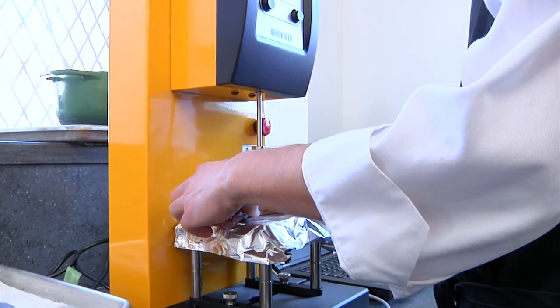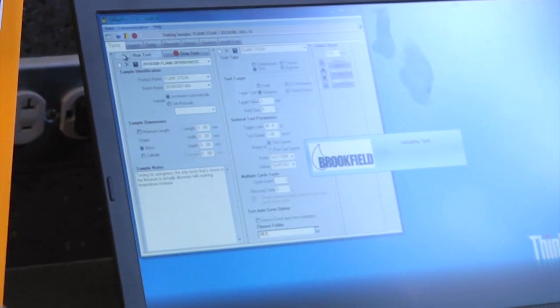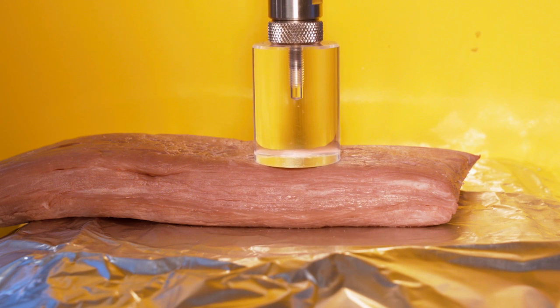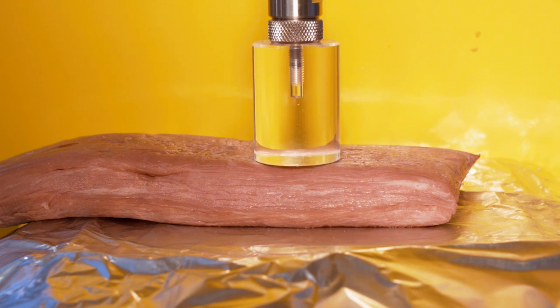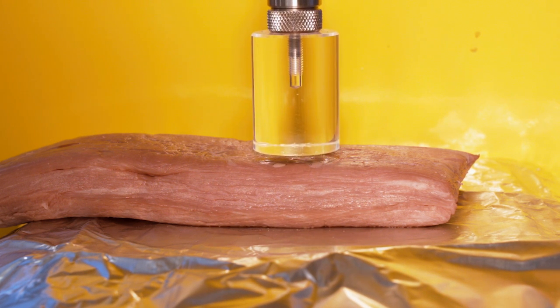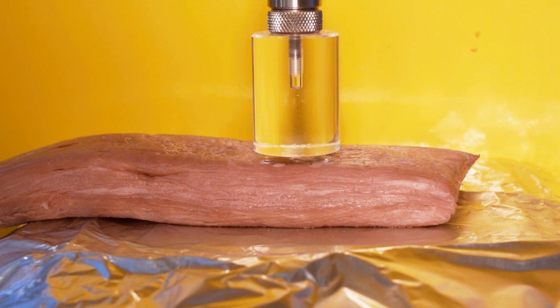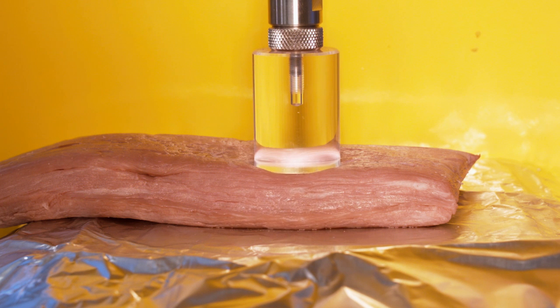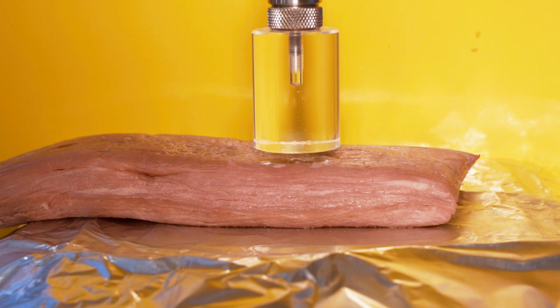So how does it actually work? Right now what I'm testing for is springiness and gumminess, which are two very technical terms. The machine will do two readings — it goes down, and once it hits the trigger load, it records while going three millimeters into the meat, then comes back out and repeats that exact same process. It measures the difference between the first and second reading — simulating the reaction when your teeth first impact the meat. Gumminess is the pull the meat has on the probe as it pulls out. Multiply those together and it's a pretty good simulation of mastication — of actually chewing something.